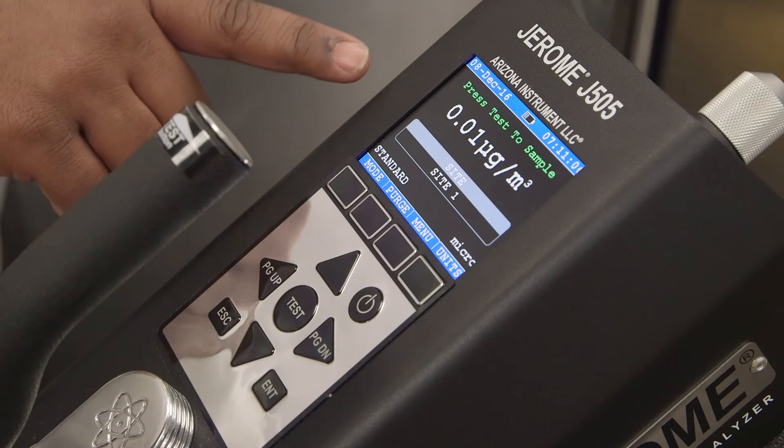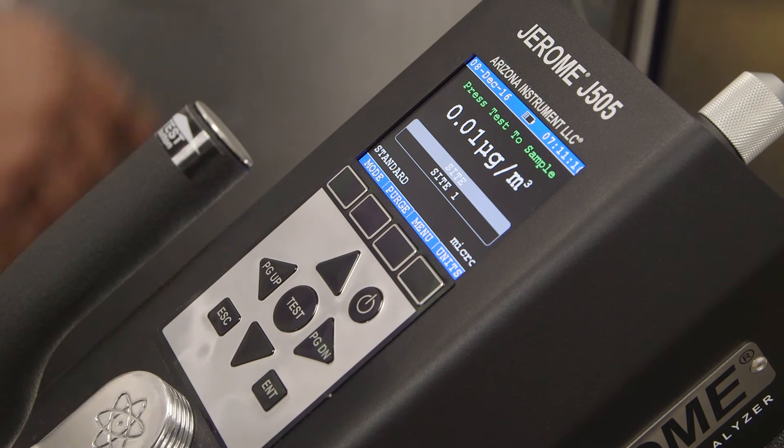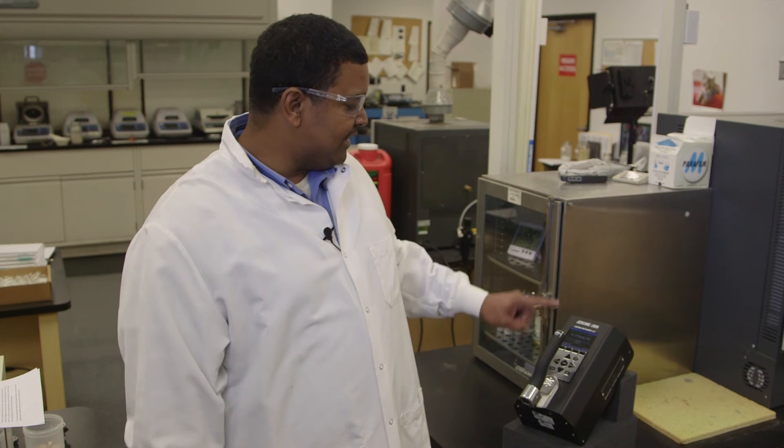Once the test is complete, the detected concentration will be shown in the display panel in the center of the instrument. The pump will continue to run for two minutes after sampling. However, you can immediately take another test by either pressing the test button in the center of the keypad or at the tip of the handle.